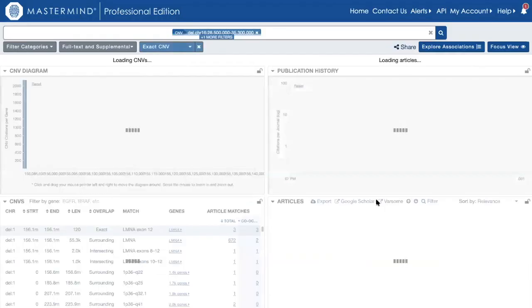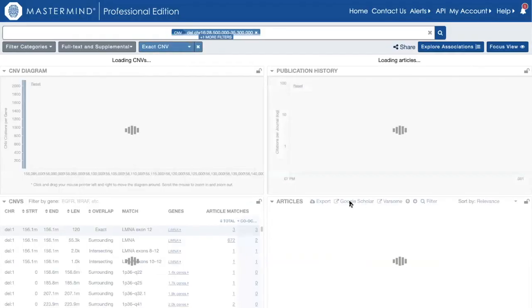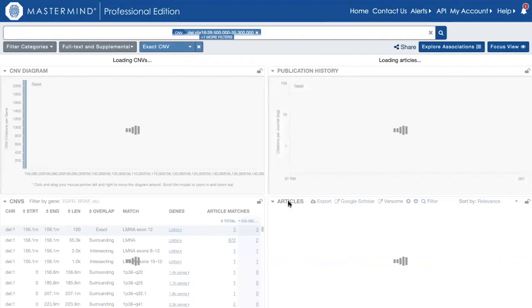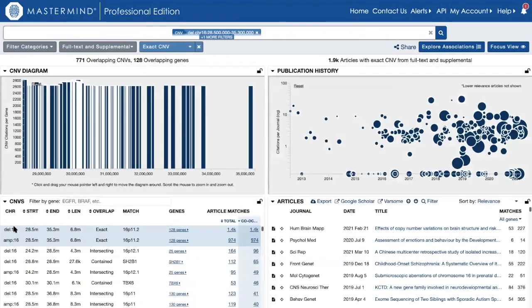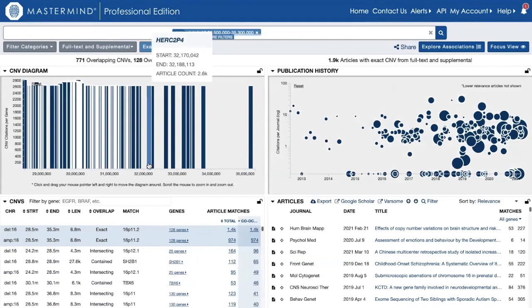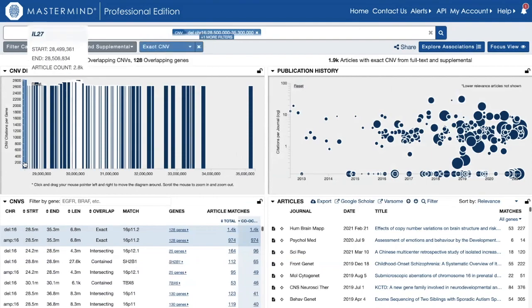I'll then perform my search and I'll get the output with both deletion and amplification exact matches organized at the top. So I can see on my CNV diagram the 128 genes within this CNV region.